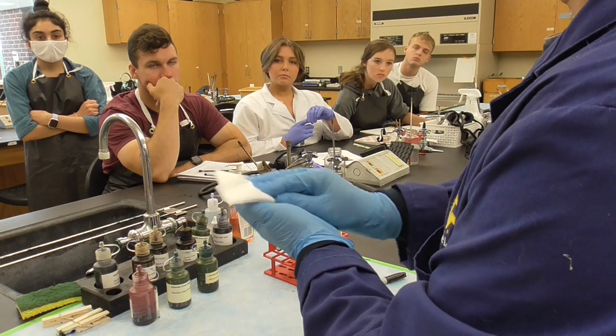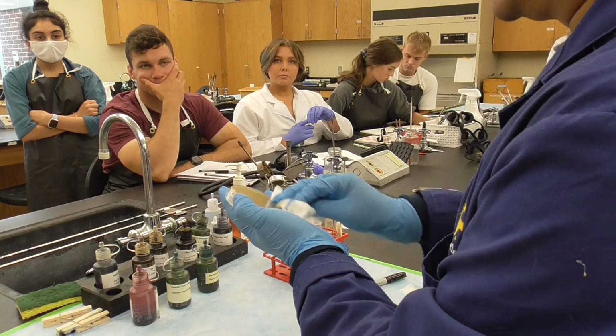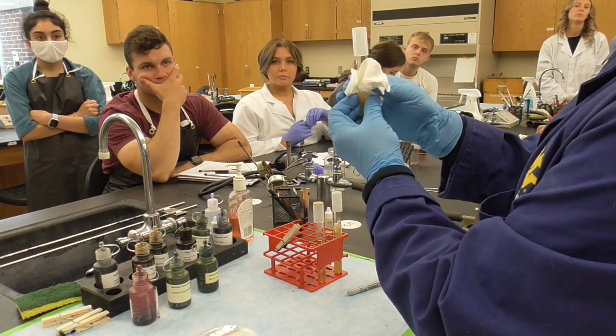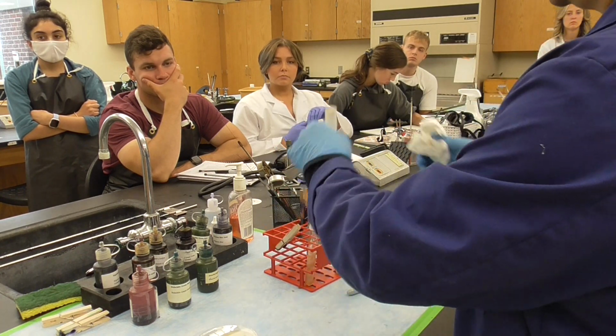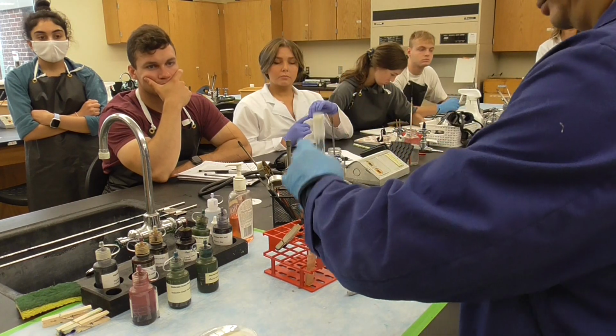And the bottom. Because the Sharpie marker will be melted or sometimes faded when it's liquid there. These types of things, if you see it's really wet, use your paper towel to clean it. Because that's important for the label.